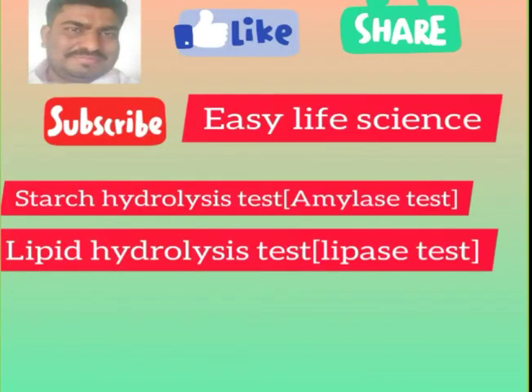Here I will be talking about starch hydrolysis test or amylase test and lipid hydrolysis test or lipase test.